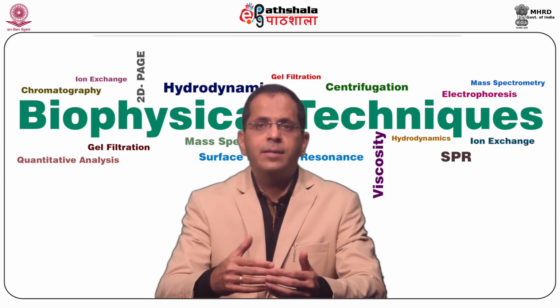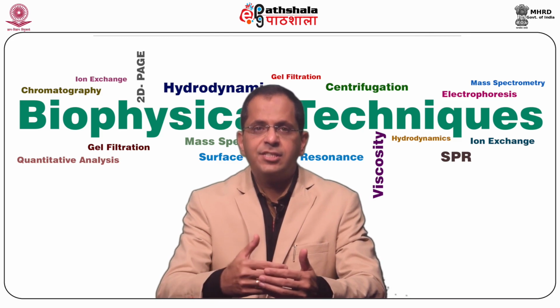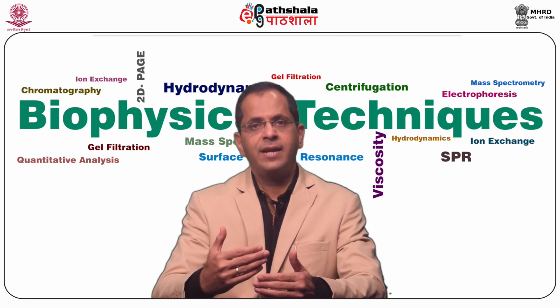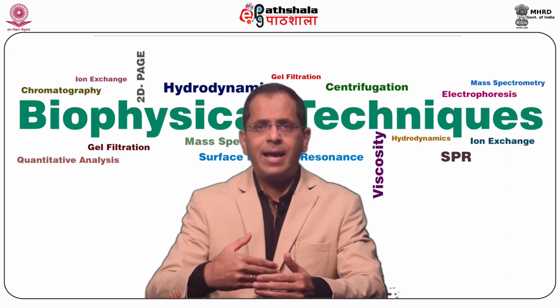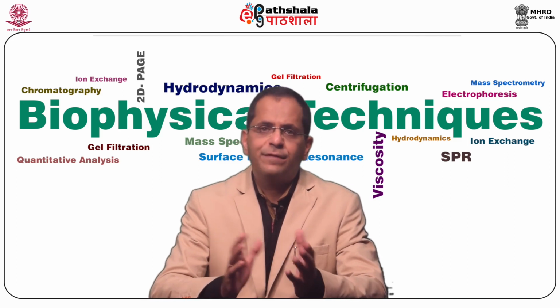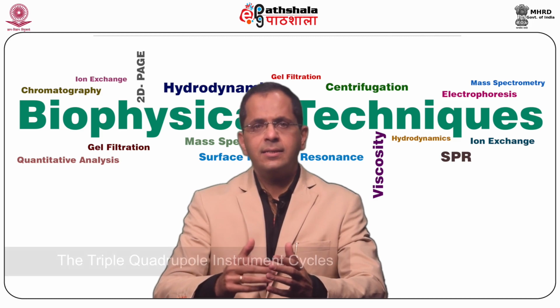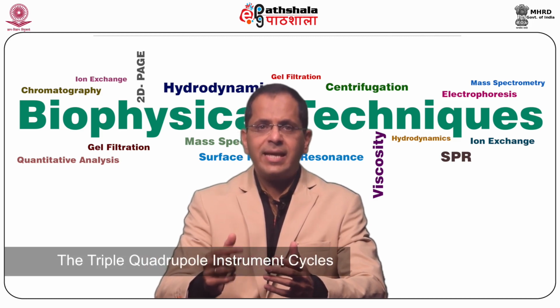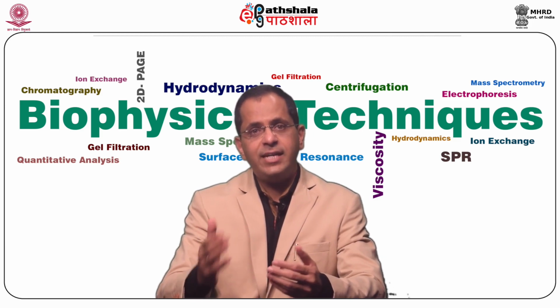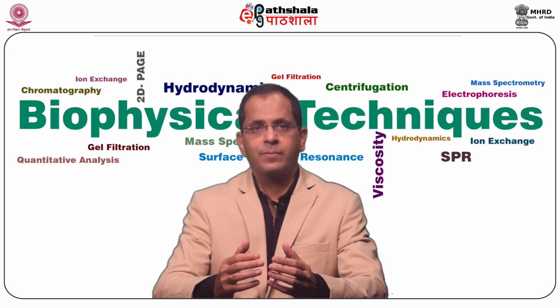Validation proteomics using multiple reaction monitoring, or what we usually call MRM. Multiple SRM transitions can be measured within the same experiment on the chromatographic time scale by rapidly toggling between the different precursor and fragment pairs. Typically, the triple quadrupole instrument cycles through a series of transitions and records the signal of each transition as a function of the elution time.